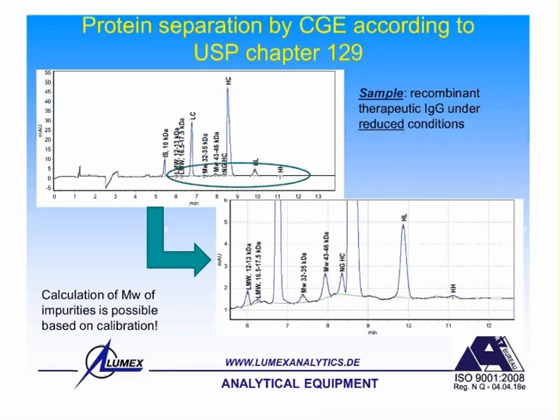And this helps us to get not only the peak of chloride, which is present in huge amounts, but also the peaks of very minor impurities like bromide or nitrates. So once again, 5,000 to 1, this is the ratio which we can still measure in ocean water between chlorides and other small components. I hope I answered this question. Okay, Caroline.